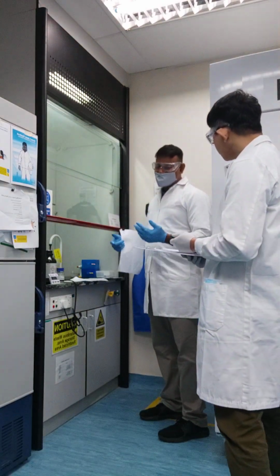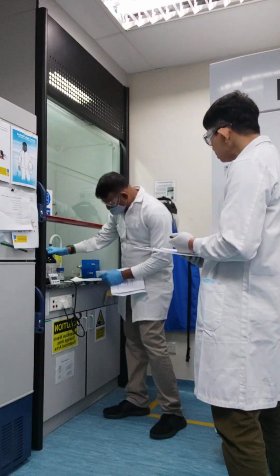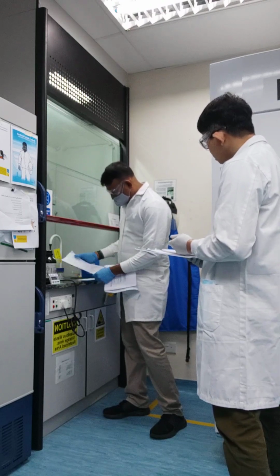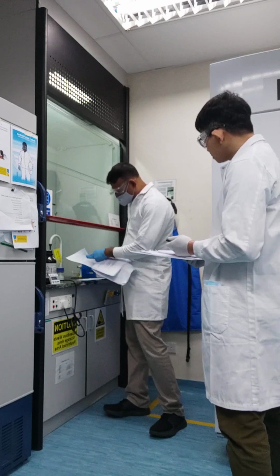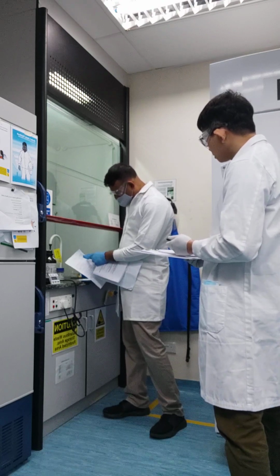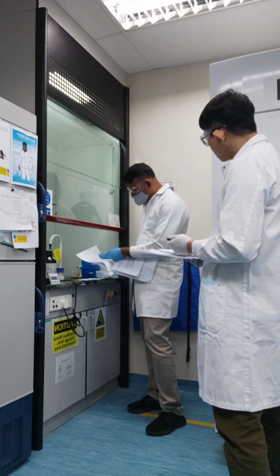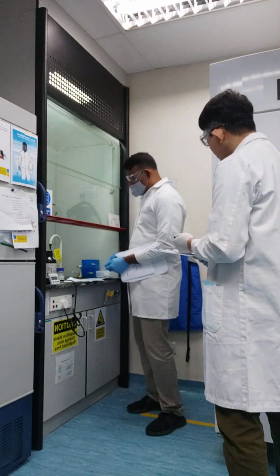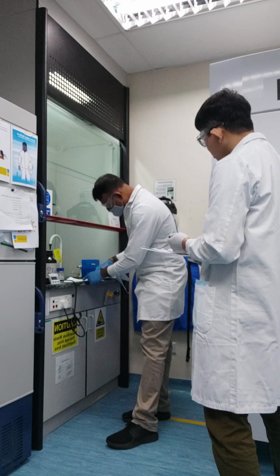Our first step is checking the chemicals against their safety information, making sure it is the correct chemical for the test method, and ensuring that all the relevant chemical solutions or reagents you are using are as per the batch sheet. I have made the checking already.